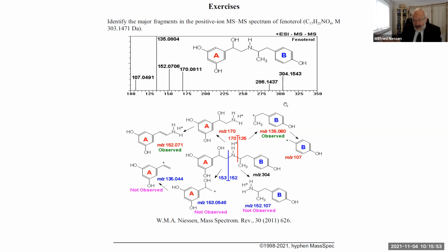And that means the other way around, it will work the same. But of course, if you would say, I have this and I don't have the structure, I have an unknown, then it might be actually pretty difficult to come out with this structure. Especially if you would also like to be certain about, for instance, the positions of the hydroxyls on the ring, because that's something which we cannot sort out by mass spectrometry. No.